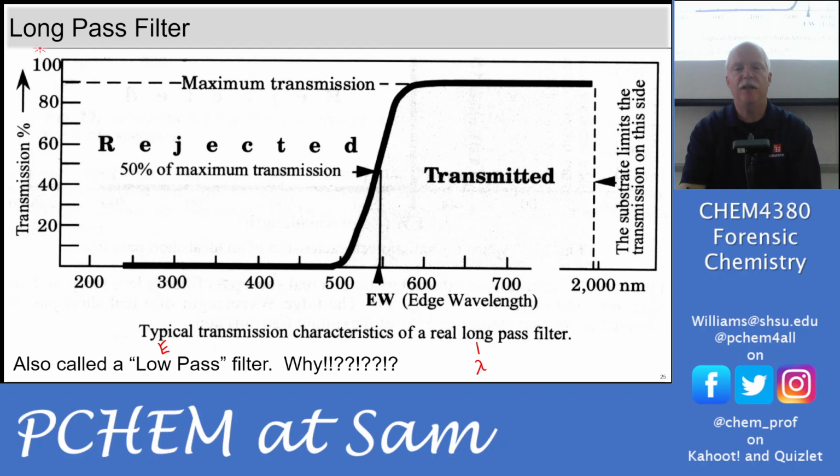And this is going to be the filter that you use for doing what? You have two options. You can use this as the illumination filter or as the observation filter. So what would this one typically be used for? Observation, because it's the long wavelength light that's fluoresced. And so we would use this on the camera. We would use this on our eyes.